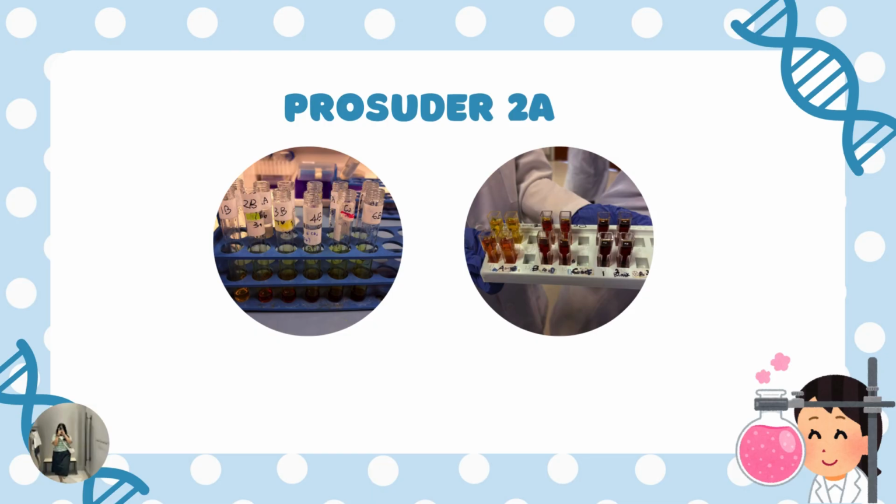The last step is we cool all of the tubes. After a few minutes, we add 1 milliliter of Rochelle salt, then transfer the solution into the cuvette. Then mix well using a vortex mixer. Then all of the samples were analyzed using a spectrophotometer.